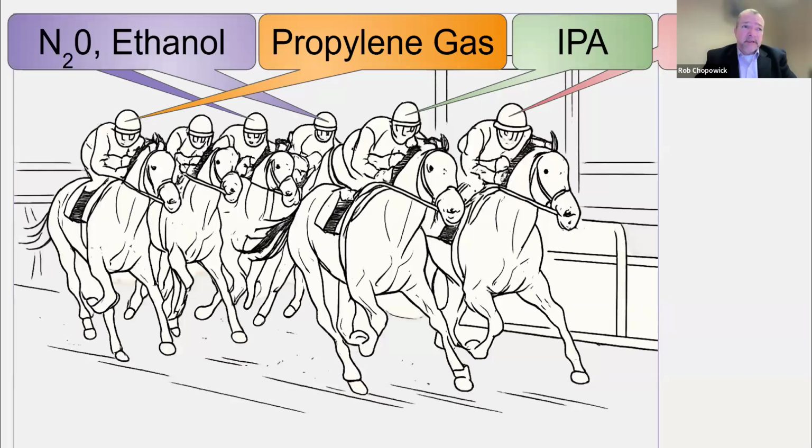Well, as the story goes, during a cleaning process, somebody noticed that these PIDs were going a little berserk. They made the connection that the vaporization or the fumes from the IPA were actually getting picked up quite well by the PIDs. So the focus of the researchers got shifted a little bit, and IPA became kind of a number one thing to search out.